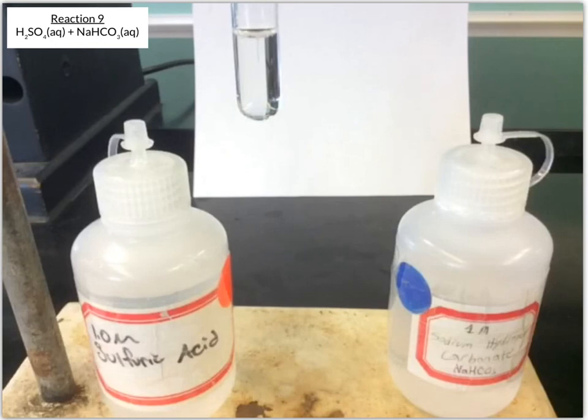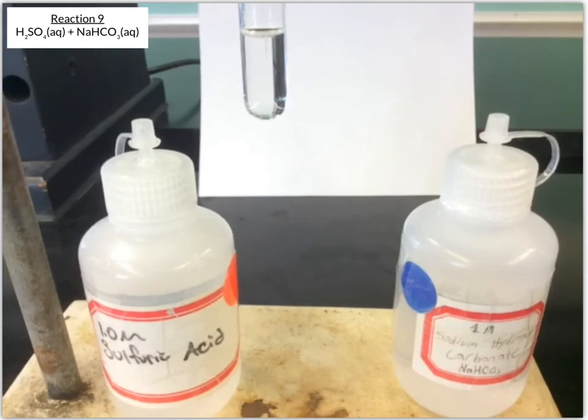Okay, so you could see right away it started bubbling, and so there was some gas formed causing these bubbles, and it's continued to bubble. It's finally fizzling out. We did start with clear solutions. The final solution is still clear, but that bubbling indicates that something did in fact happen. Some gas formed, and even as I disturb it there, I get it to react some more. And so you've got lots of bubble formation, so lots of gas being formed in that reaction.